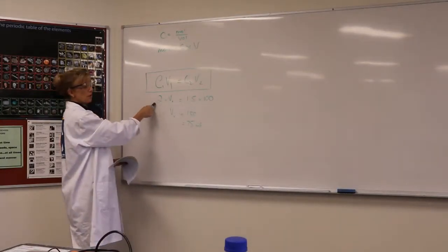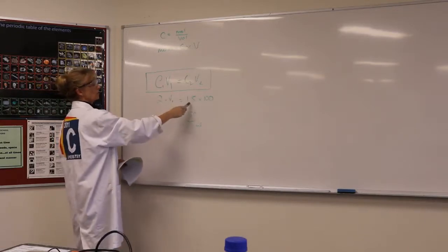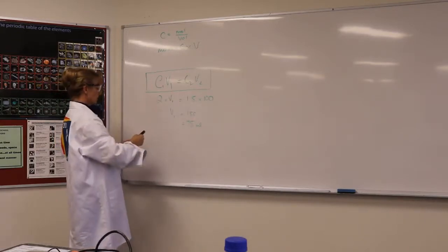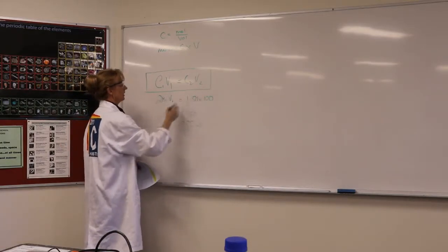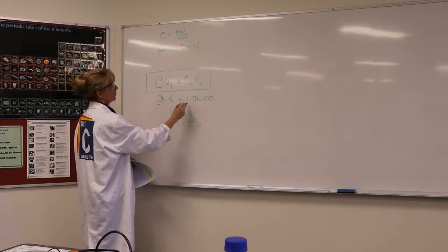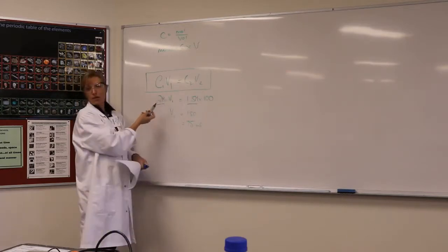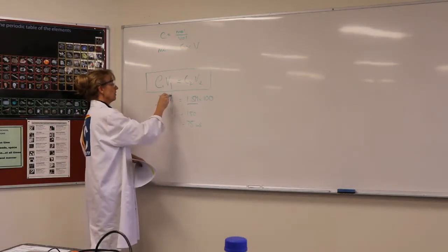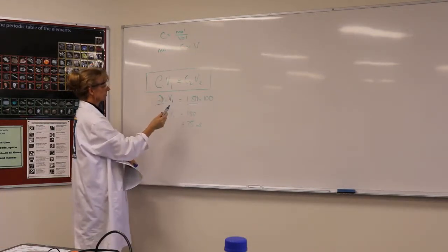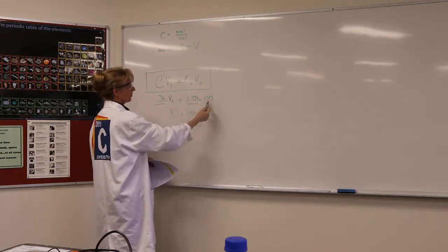If your first concentration C1 is 2 molar, and you want it to be 1.5 molar, so I'll just put the units in there so you can see, molar, molar. So if you start with 2 molar and you want it to be 1.5 molar, you put this in. You want to know how much of your original to add to your water, so you write V1 because you don't know. And your final total volume you've got to put here. So it's 100 mils in this case.